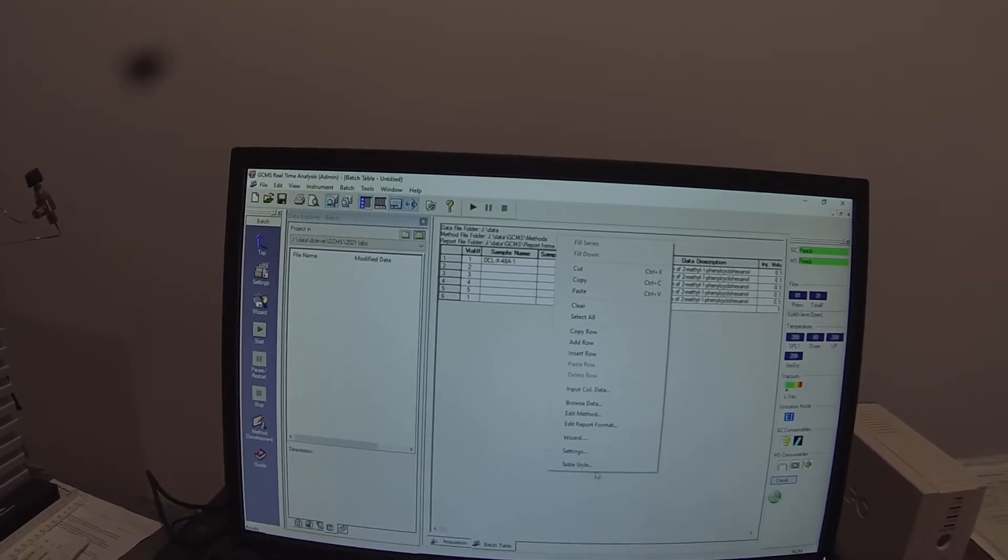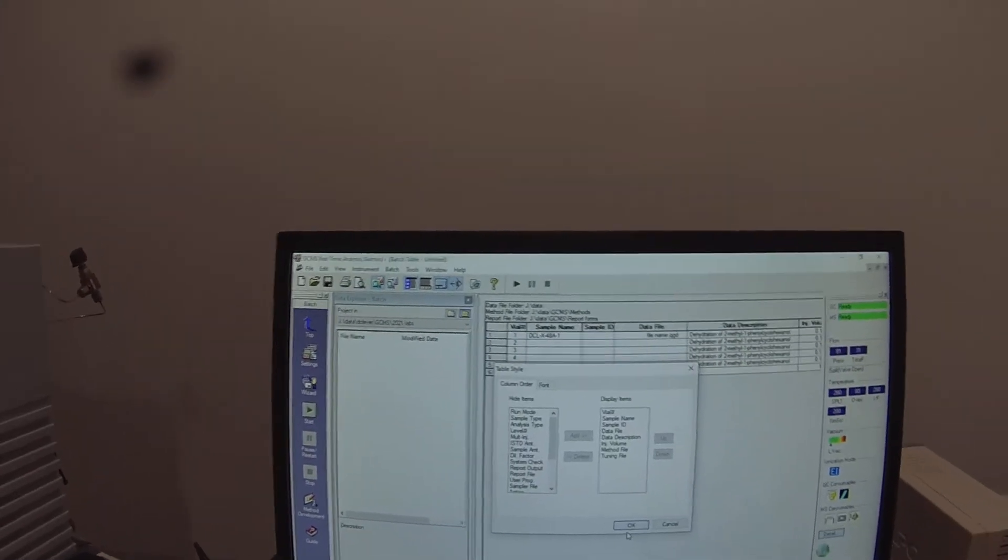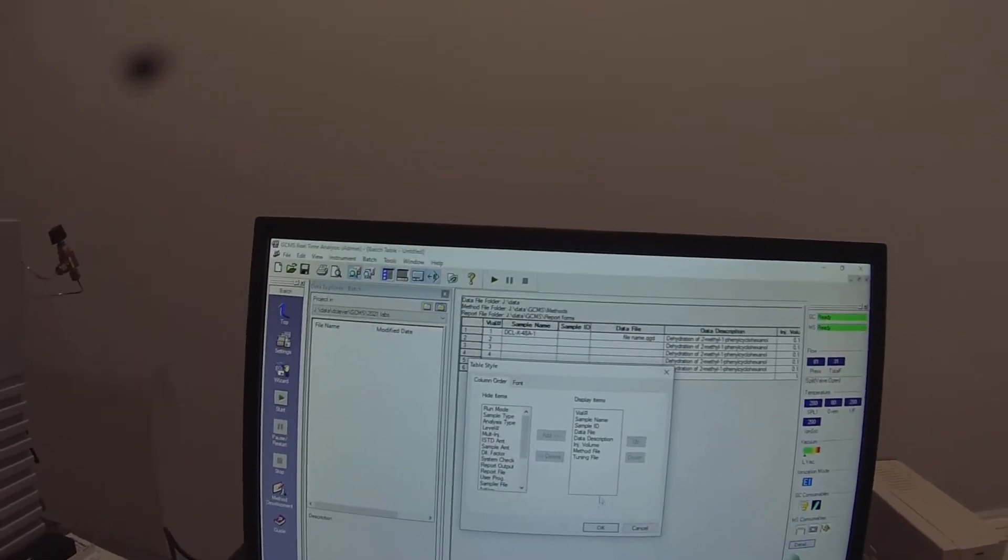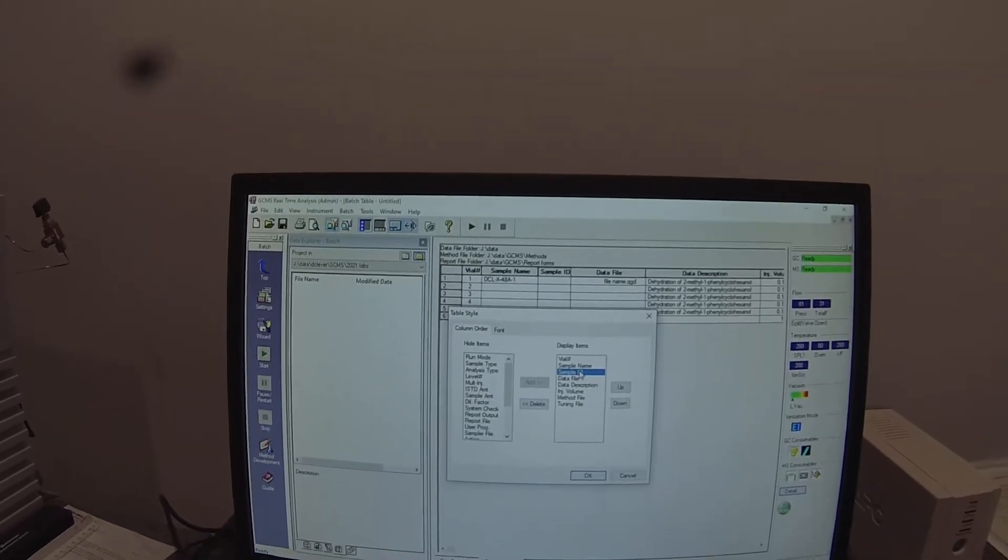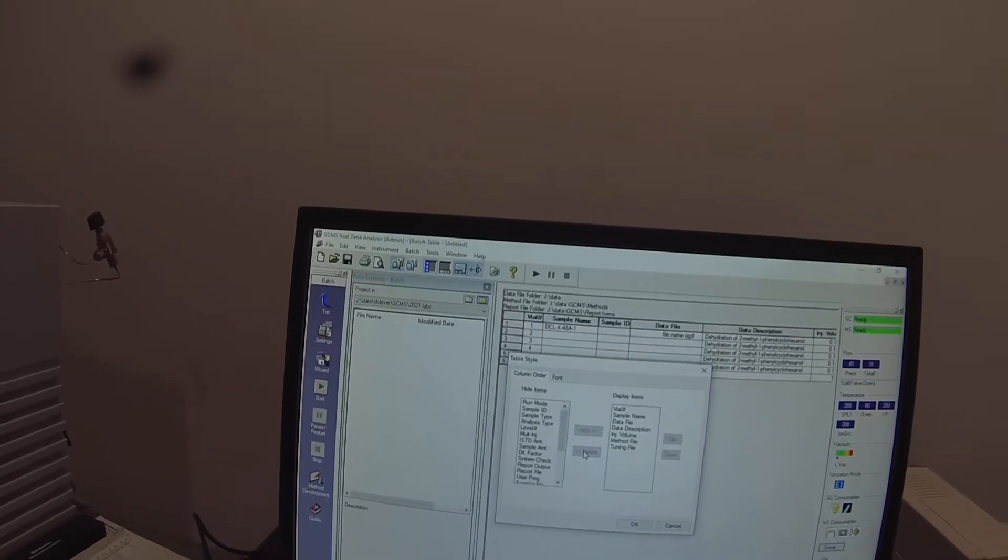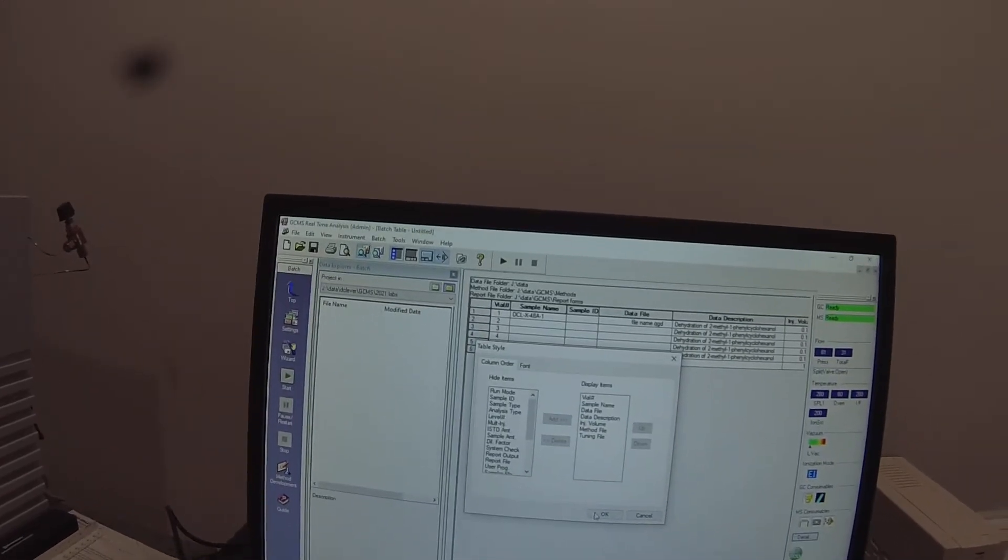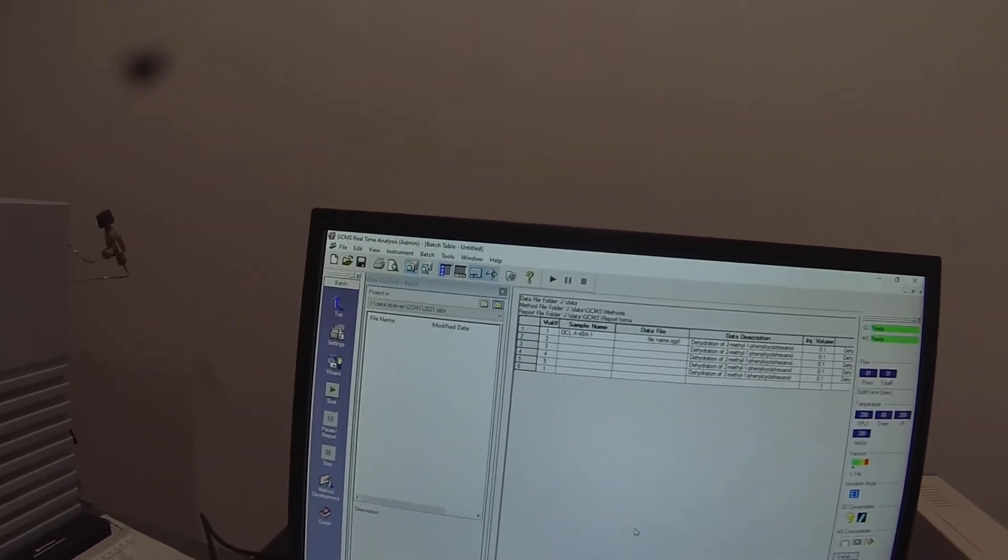And I could go to table style here and tell it that I really don't need the sample ID at all. Let me delete that column. So we don't have it at all.